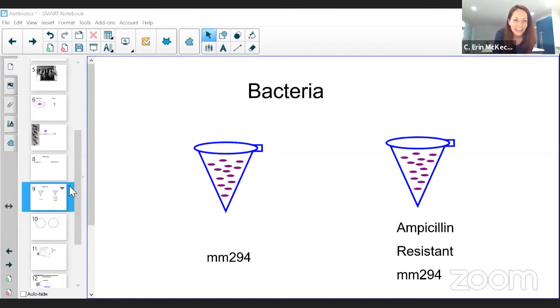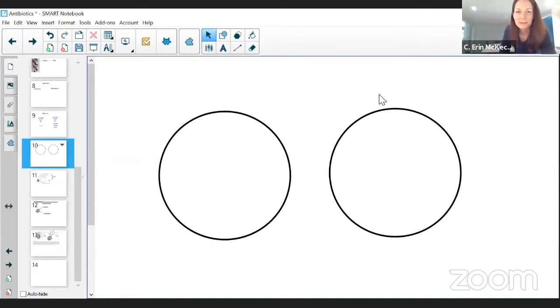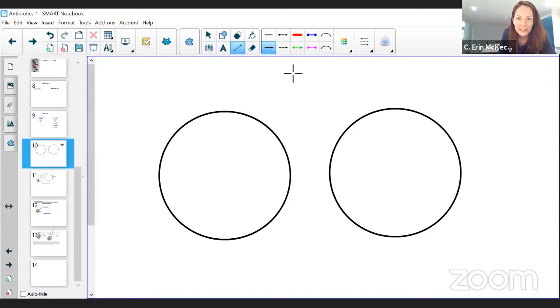Okay, you guys see that? Let's see. I think I've got my Petri dishes here. Okay, yeah, so I didn't label my Petri dishes yet. So what I'll do is I'm gonna make this very simple for myself. I'm gonna draw a line down the center of the dish.